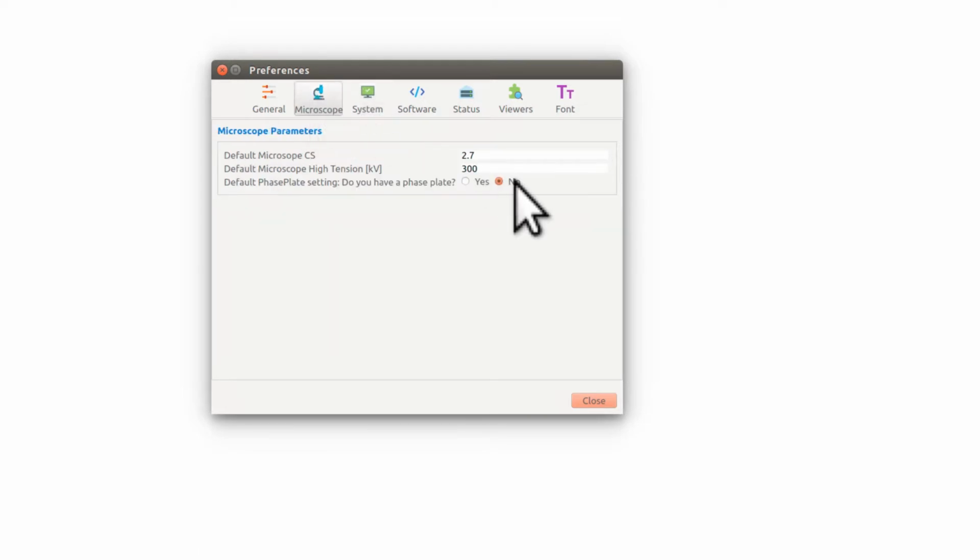Oh, by the way, Focus immediately saves all values that you type in, so you would always delete a field and then type from scratch. Focus is not good in entering a character somewhere in the middle, because the cursor always jumps to the end of it. So you just delete a field and type it again.